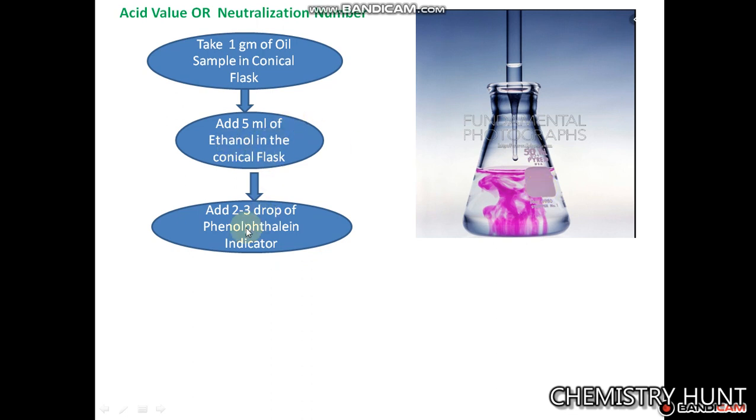In this conical flask, we take oil, then ethanol, and then add two to three drops of phenophthalein indicator. After that, titrate with 0.1 normal KOH solution.